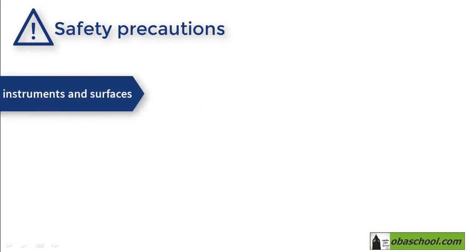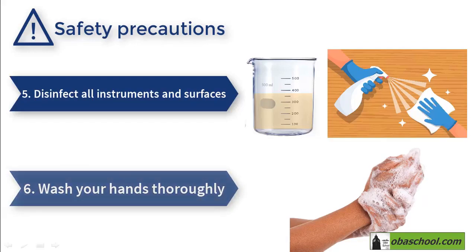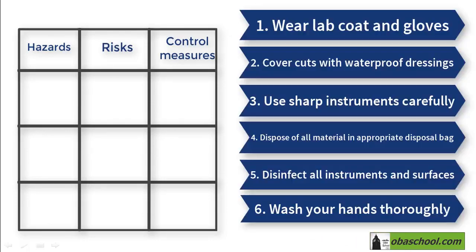And at the end, disinfect all instruments in beakers and the surfaces using a disinfectant spray and paper towels, as well as wash your hands thoroughly with soap and warm water. You might be asked to write a risk assessment before beginning the practical work. It's often recorded in a table including the hazards, risks, and control measures. So here's the list of precautions that you should consider and a risk assessment table.